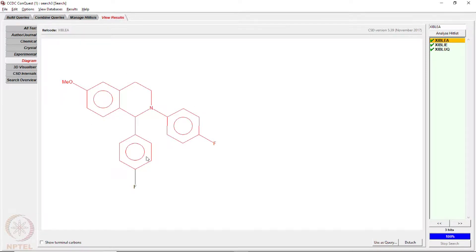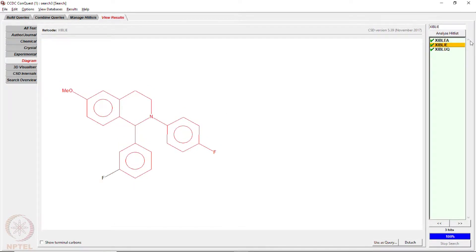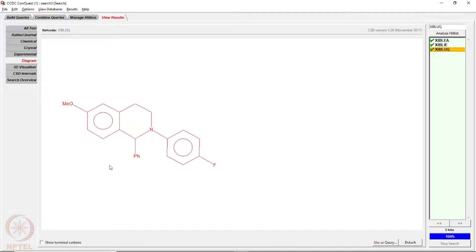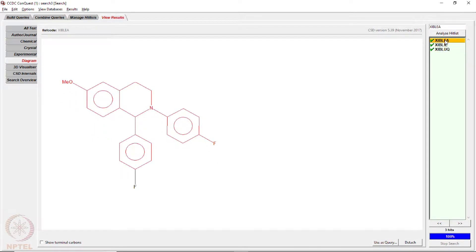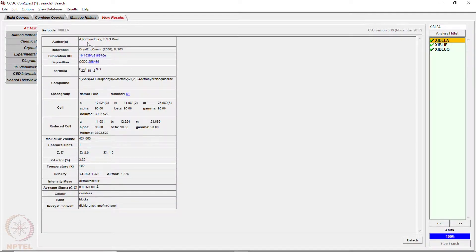The red portion shown here is my query fragment, and the black portion shows additional atoms present in the found structures. So you have molecule 1, molecule 2, and molecule 3 — which does not have any fluorine on the ring. That is the query molecule I provided. If we click on the 'all text' option, you get the authors. As you can see, these are structures from our own research, and it gives the reference and the DOI for the publication.